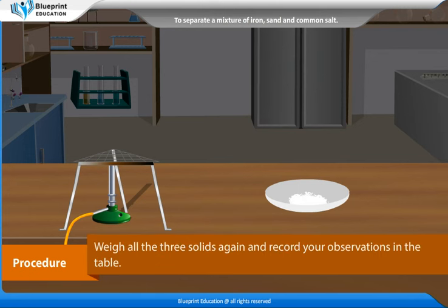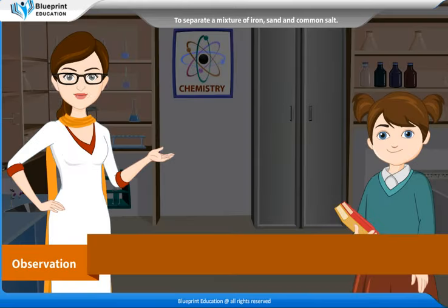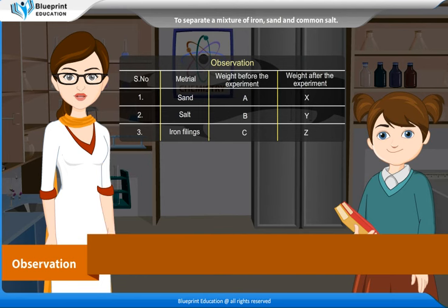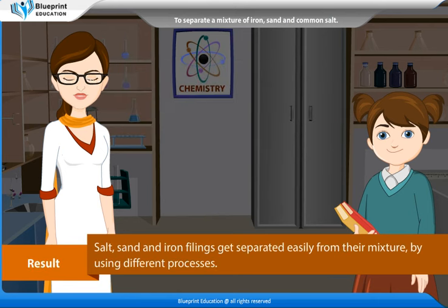Weigh all three solids again and record your observations in the table. Record the serial number, material, weight before the experiment, and weight after the experiment for sand, salt, and iron fillings.